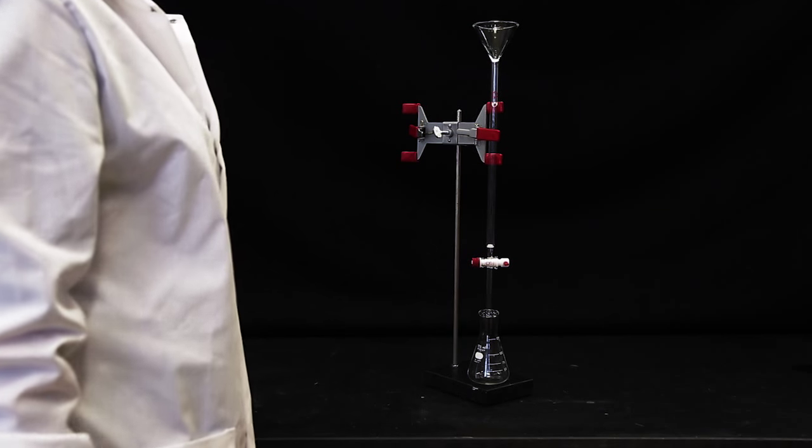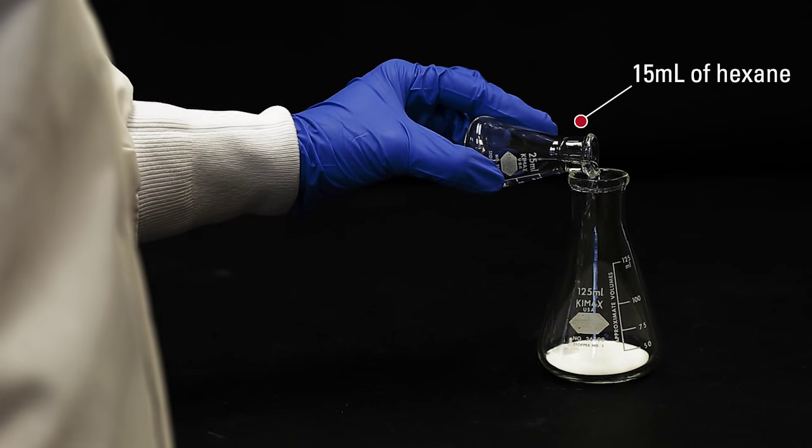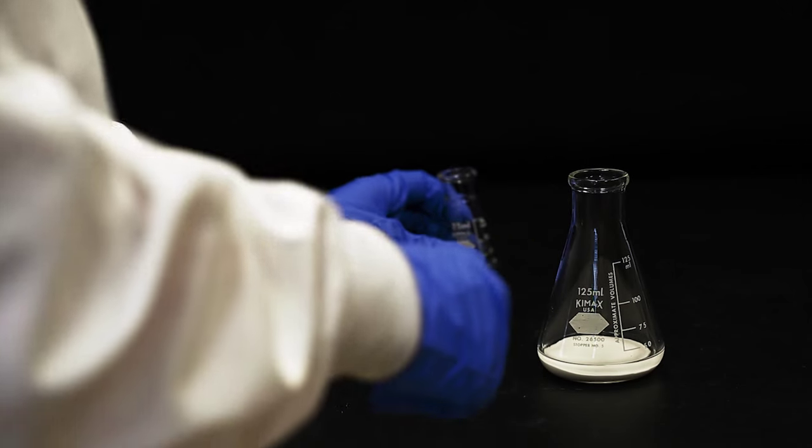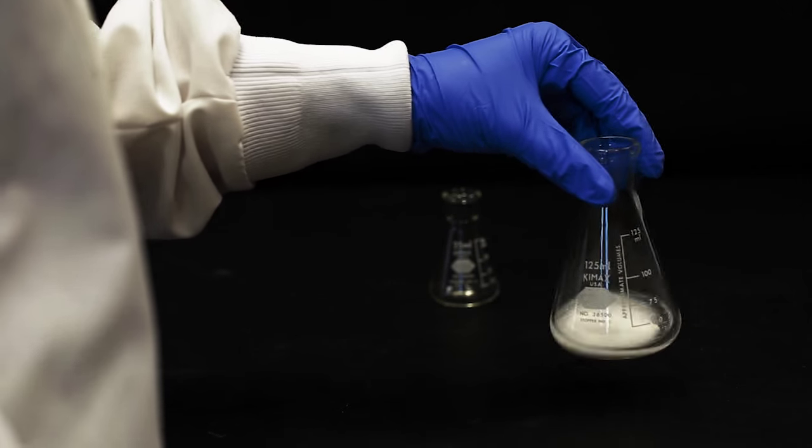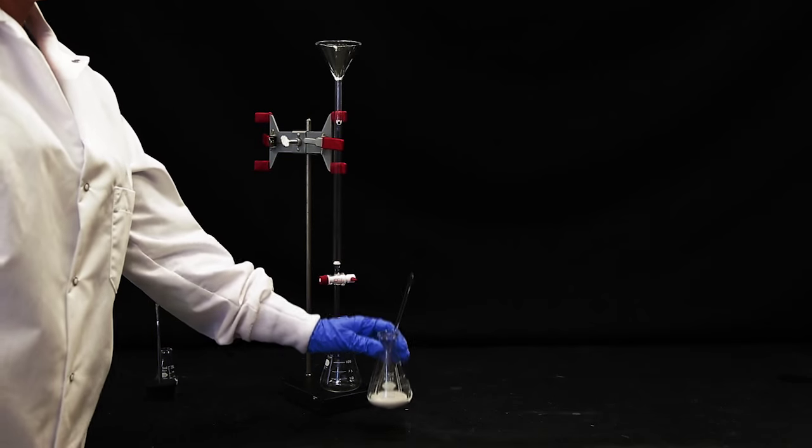Place an Erlenmeyer flask beneath the column. Prepare the alumina slurry by slowly adding 15 milliliters of hexane to 8 grams of alumina powder while swirling the mixture. Use a glass rod to mix the slurry.